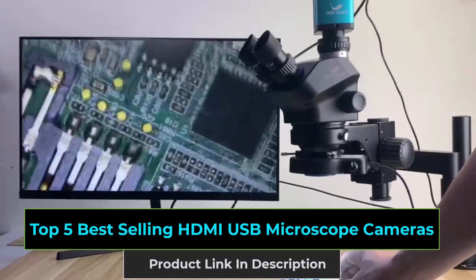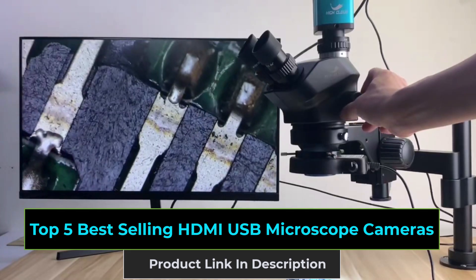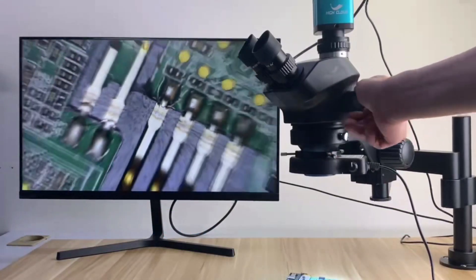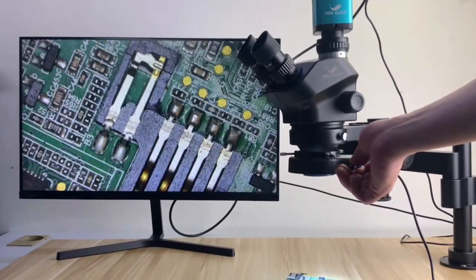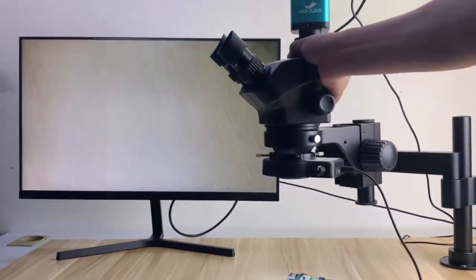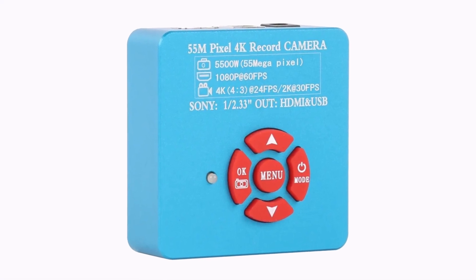Discover the top 5 best-selling HDMI-USB microscope cameras. Whether for electronics, biology, or detailed inspections, these cameras bring together high-resolution with convenience for an unparalleled viewing experience. Perfect for both professionals and enthusiasts, these microscope cameras will make your work more accurate and efficient. Watch now to find your perfect match.